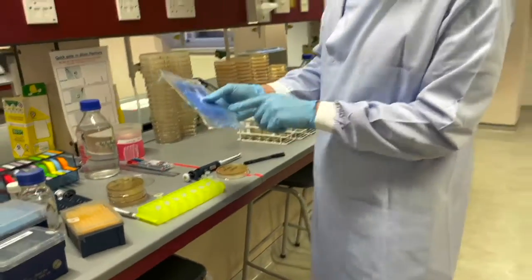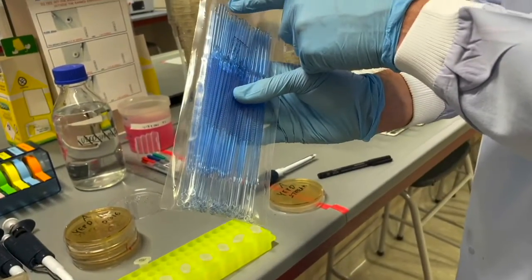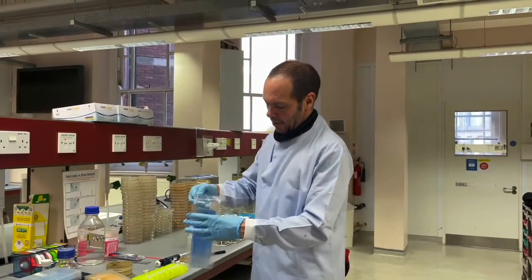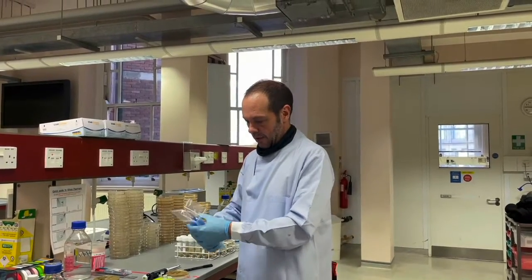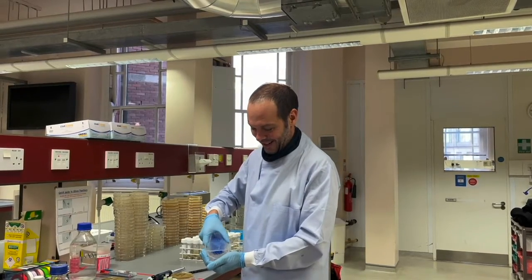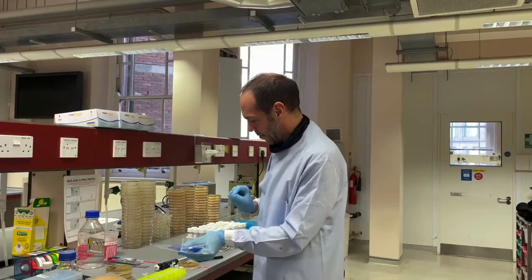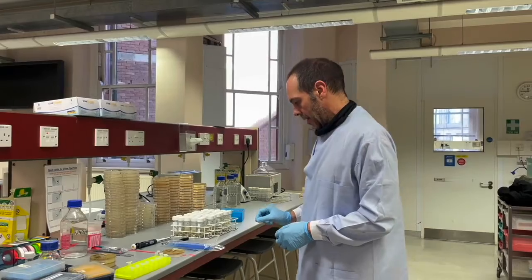Right, so the end that you use is the end with a loop on. The other end's where you hold it. So we want to open it at the right end, and we're going to try to keep the contents sterile. I don't want to stick my hand in there and introduce lots of outside bugs. I don't usually use these, so I'm going to try this. It could fail terribly. I'm just going to tap some down so that some of them stick out like that, and then I can grab one without contaminating the rest of the bag. I'm going to put them on the edge of the bench like that.